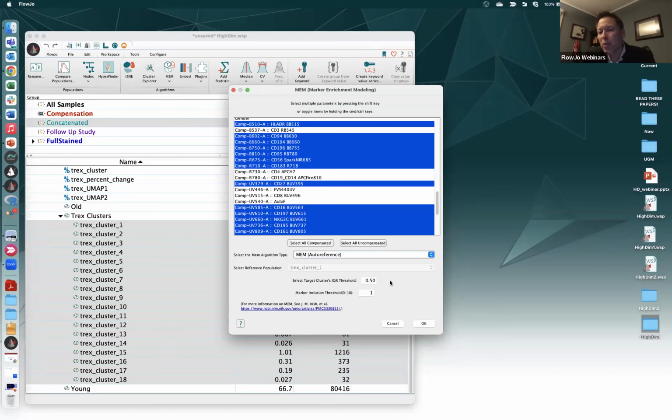So it's saying, in one spot on the plot, one k-nearest neighbors identified population, do we have a 95% fold increase of number of events from one condition to the other? That 95% was because I typed in my upper range as 95 to 100. You could set it to be however large a fold increase you deem interesting to look at. So that is what the number represents.